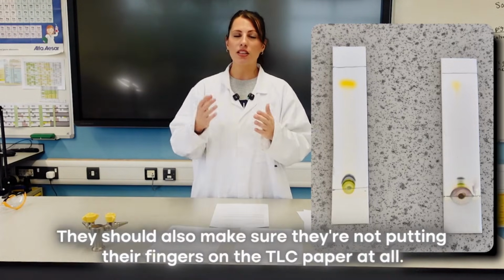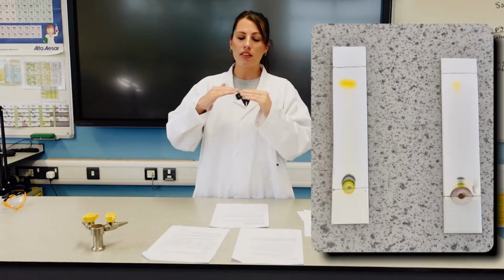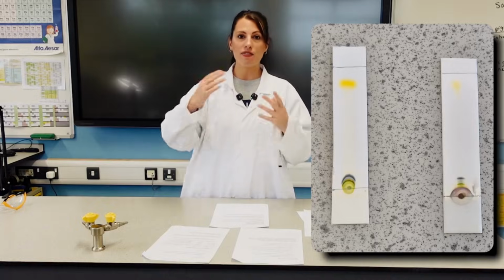They should also make sure that they're not putting their fingers on the TLC paper at all, because that can interfere with the ability for the pigments to move up and affect the results.